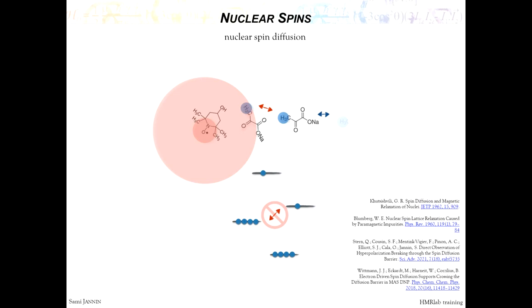Paper from Bjorn, there's Corzilius, there are papers from Griffin, and many other papers that you cite in the paper that show evidence that these spins that are very close, they are shifted in frequency. Sometimes you don't even see them by NMR, but they participate in the DNP process.